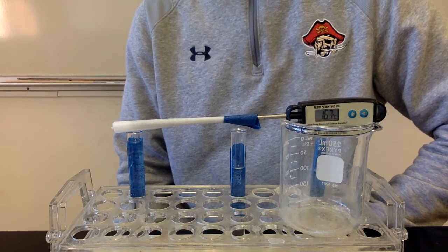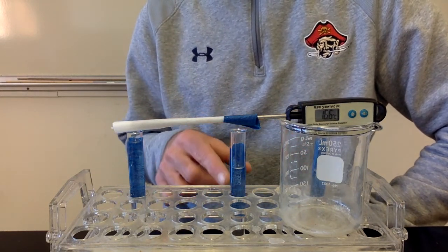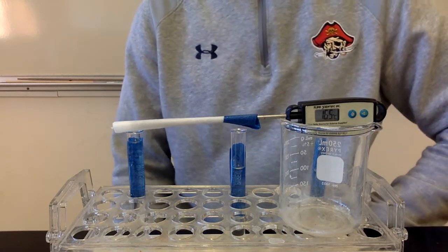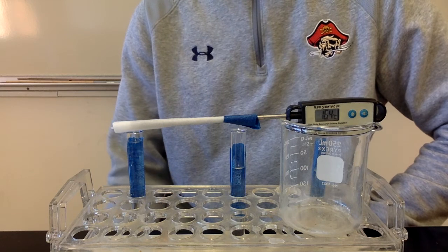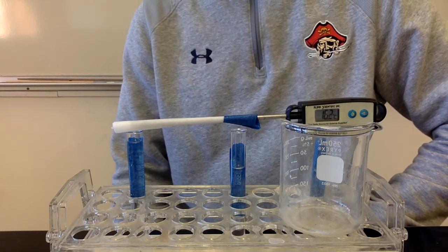And we're going to do that for each one of these liquids. So right now we're doing it for the water. And then after this, we'll do it for the acetone and ethanol. And that way you're going to be able to compare how quickly the liquids evaporated and how much lower temperature each one reached.